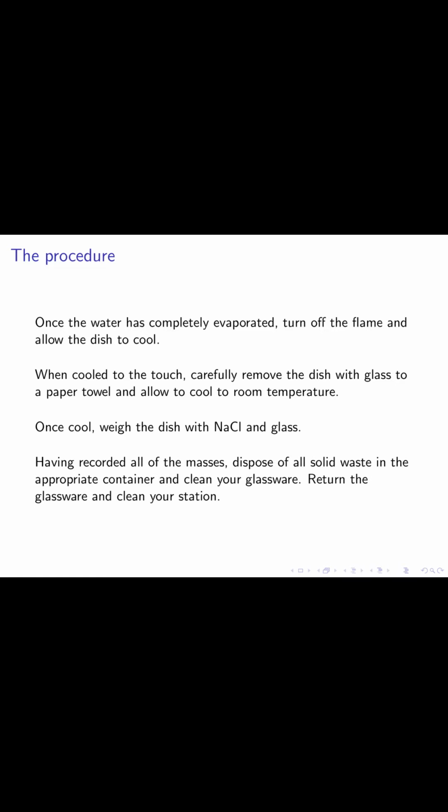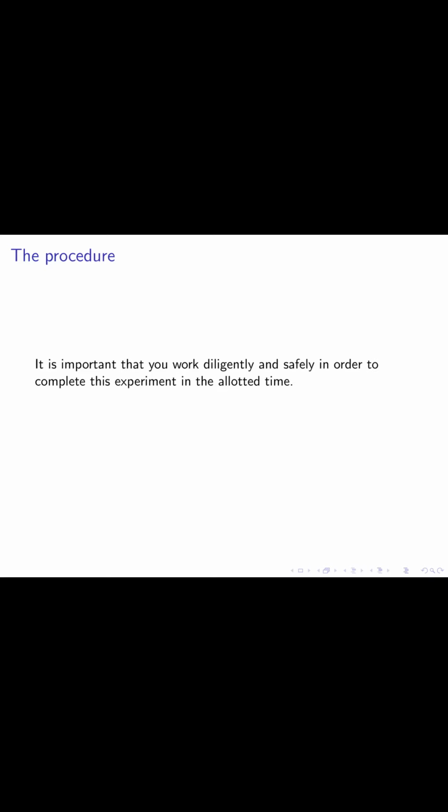Having recorded all of the masses, dispose of all solid waste in the appropriate container and clean your glassware. Return your glassware to its appropriate location and clean your station. It is very important that you work diligently and safely in order to complete this experiment in the allotted time. A second video will be posted in the coming days to describe the required calculations and report information.